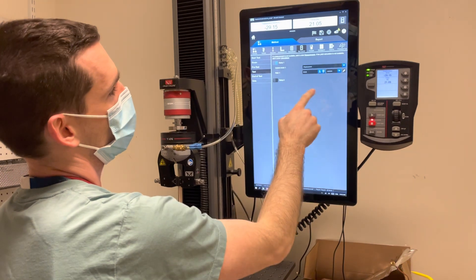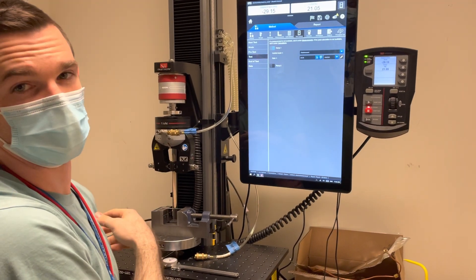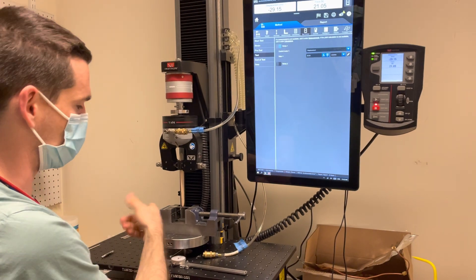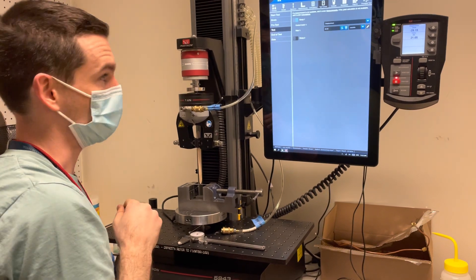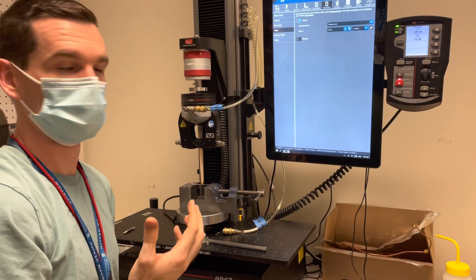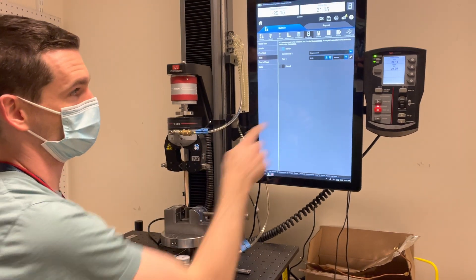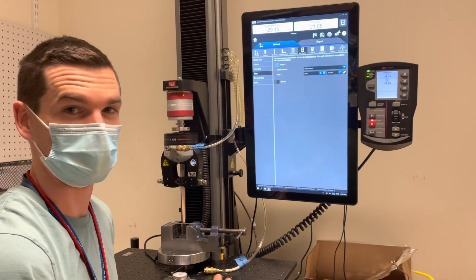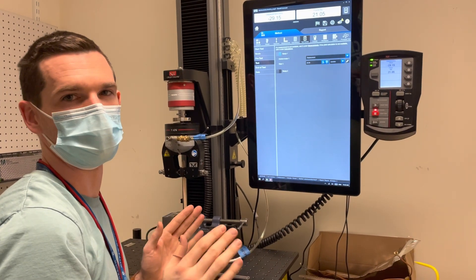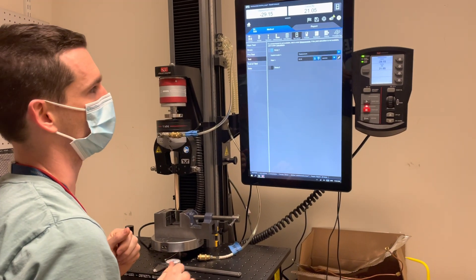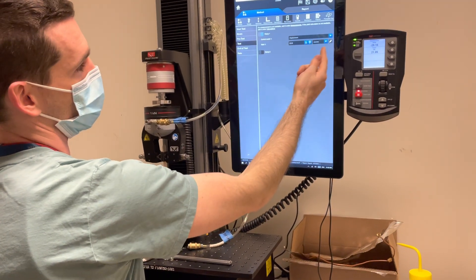In my test here, I'm displacing the crosshead at 25 millimeters per minute. This is a custom setup where I want to move the crosshead down to bend an aluminum strip, so I'm using a compressive test method setup — it's going to move the crosshead down when I put a number in here. If it was a tensile method, it would move up. So that's how choosing the original test method matters. It's going to move at about an inch a minute, and you can change units if needed.